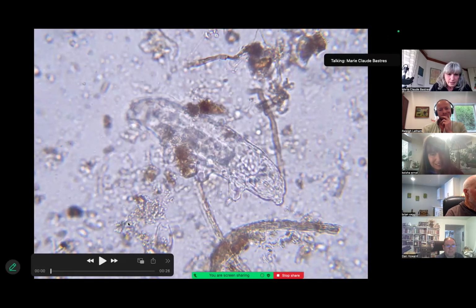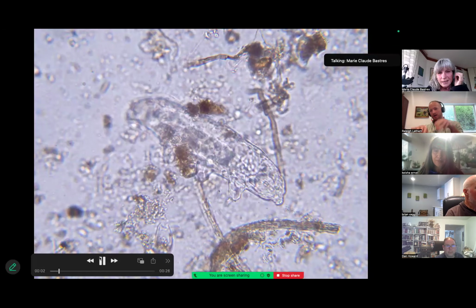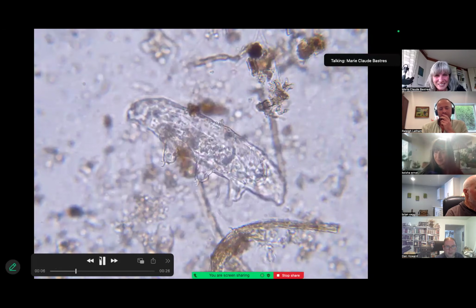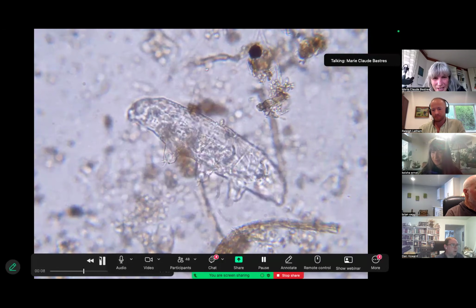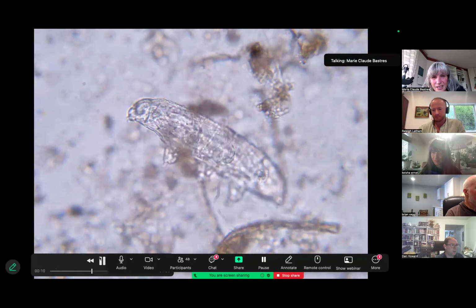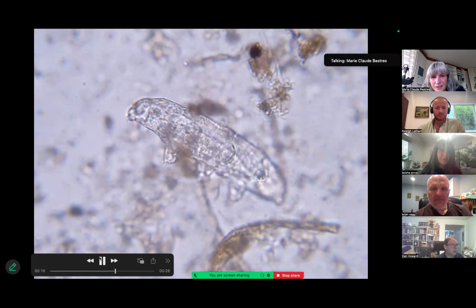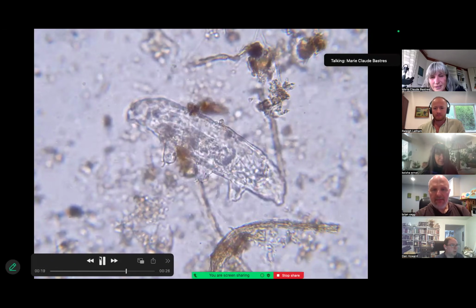Nails. Oh yeah, claws, yeah. See the little ones there? Three in each. This one is not moving, but we can see the whole thing. I'm just taking a nap.